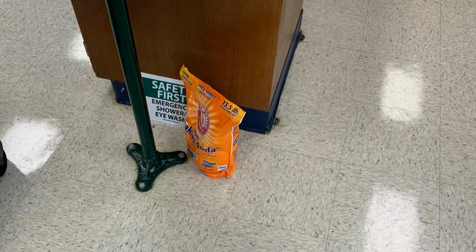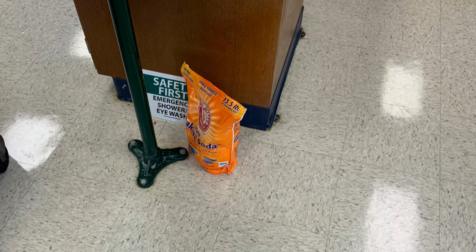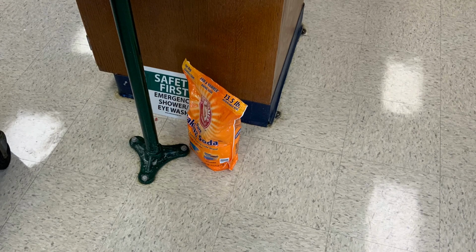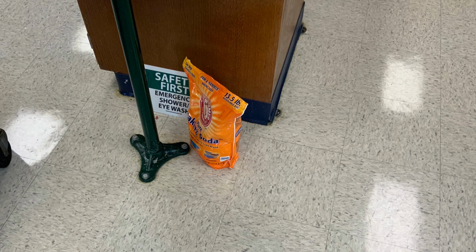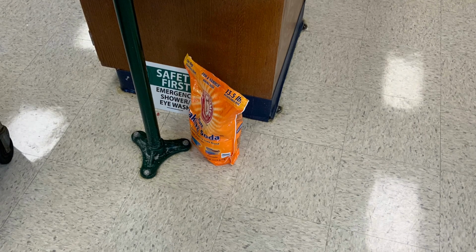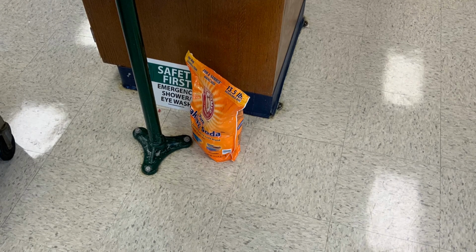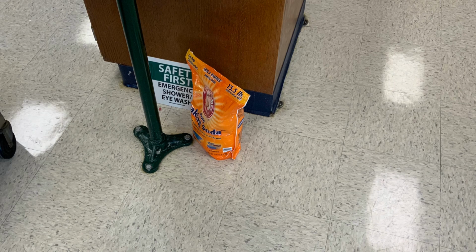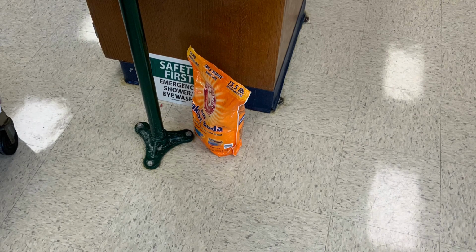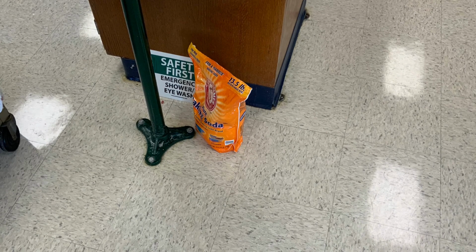And last but not least, we have a bag of baking soda in the lab, just in case any acid is spilled. This baking soda will act to counteract the acid, seeing as the acid is obviously acidic, and the baking soda is basic. If you pour the baking soda on the acid, it will neutralize it due to the fact that it's basic and the acid is acidic. And the acid will be neutralized and will either evaporate or turn into a liquid, or whatever happens, it will no longer be harmful to the lab.